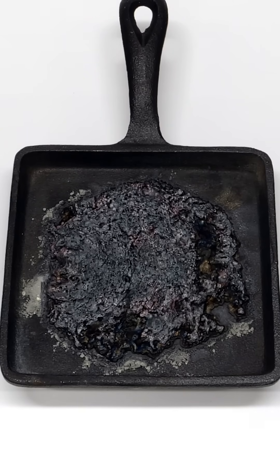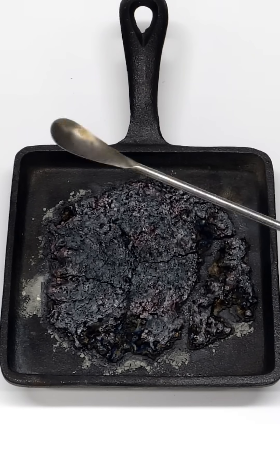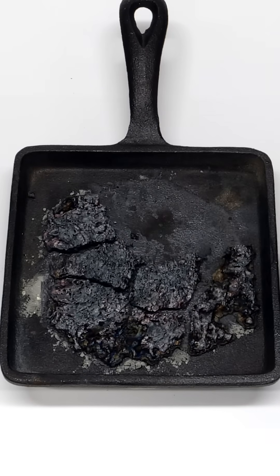When it's done and after it's cooled down, I'm left with a large chunk of iron sulfide, which I'm sure I'll find something to do with.